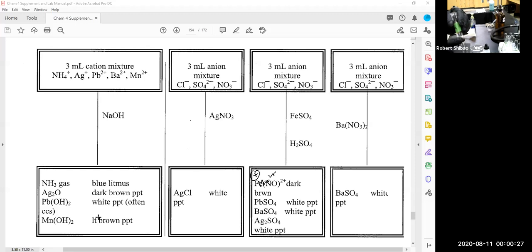And so this is waste here as well as this. Let's check our ammonium. There's still no evidence of blue, so I'm sure ammonium, nothing happened there. So I'm going to dump this in the waste container, which I have set down here. And the same thing for the ammonium test, I'm going to just dump it into the same waste container here. And then let me clean.